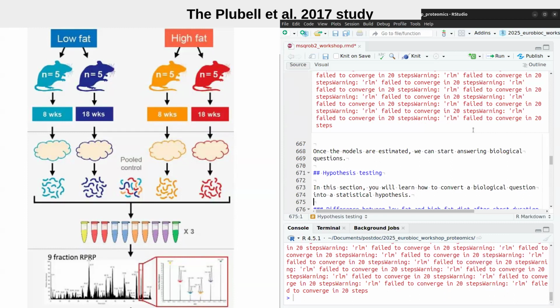Yeah. So again, this is not something I benchmarked, but my feeling would be, okay, if you have different PSMs for the same peptide ion, well, you don't really know which one is correct. I will just remove them all. But that would be my take. Or did I not understand your question? In peptide sequences, different charge. Okay, that's what you mean. How to aggregate them to peptide then? Or sum it up.